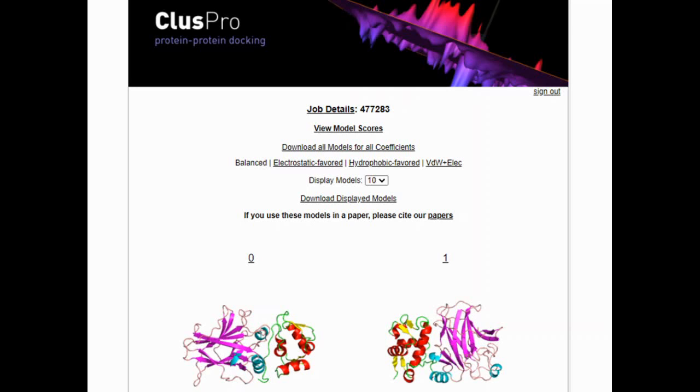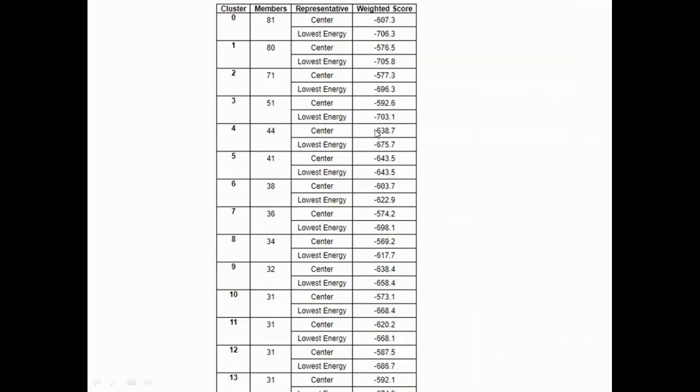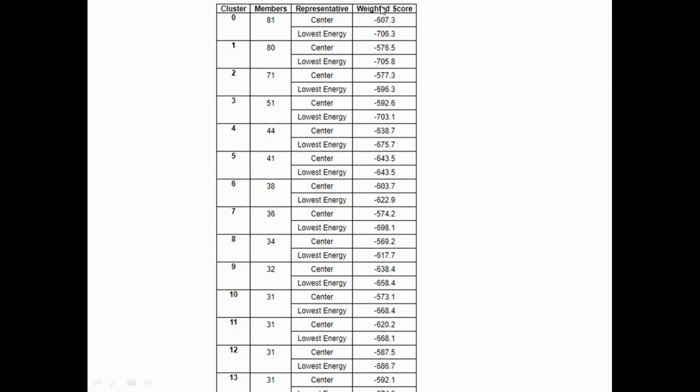In order to know this, you will have to look at the docking scores. You can see balanced, electrostatic, hydrophobic, and van der Waals. You have to click on 'view model scores'. If you click on view model scores, it will display the model scores of the balanced. I had selected more than 10 models here. It starts from the first one, that is your 0th cluster, and then it goes down to how many clusters you have selected. If you see your first 0th model, it gave the lowest energy of minus 706.3. The center is your overall one, but the lowest energy is what we are more interested in.